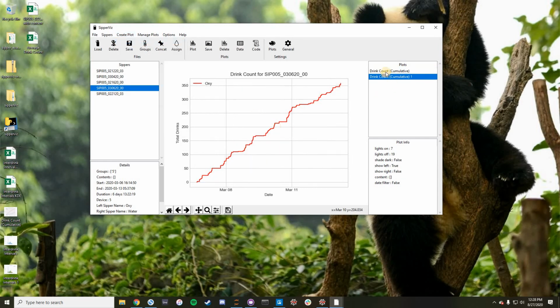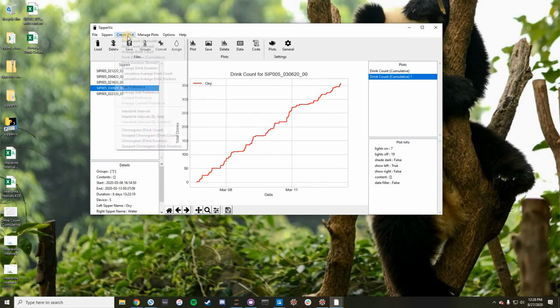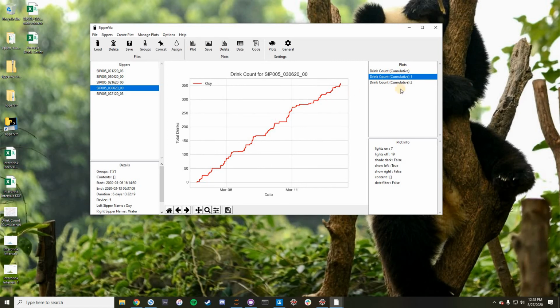And you'll see there's these changes. If you want to reload those settings, I'm just going to hit that. And then if I create the plot again, now it's back to the ones used by this first plot. Back to the settings.